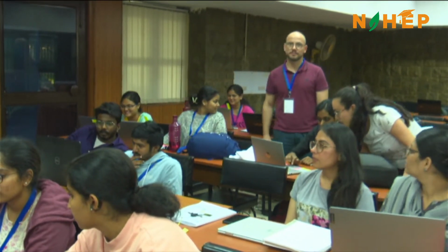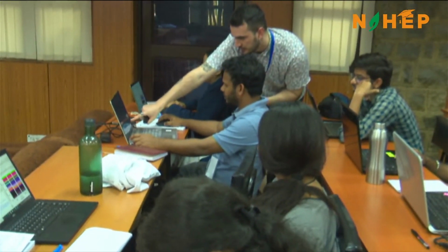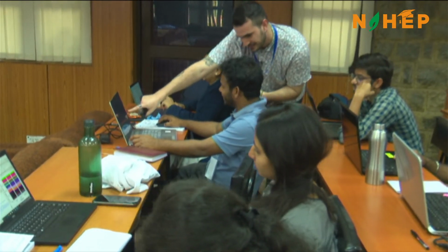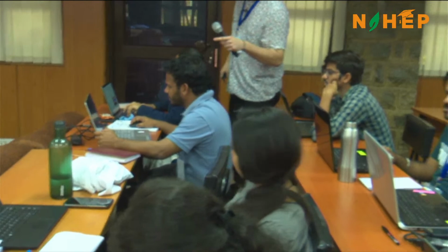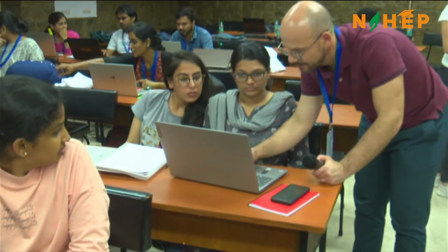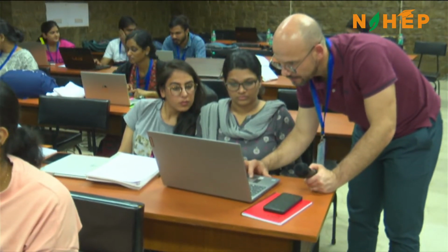I know, sir, you need to load the environment first. So you go to files, you need to first unzip this. You see that it's .zip. You need to extract that in your folder, not the zip one. You need to unzip it and load the environment.